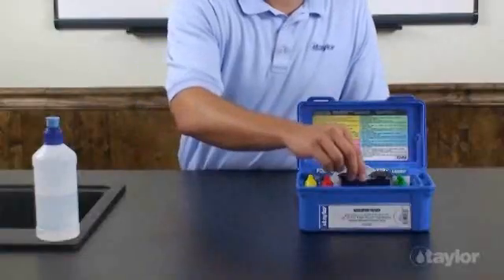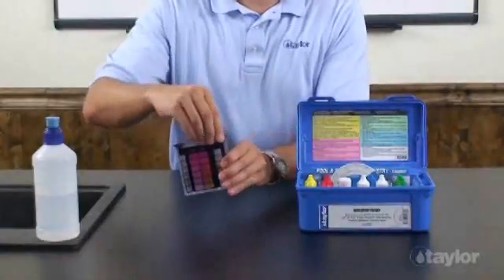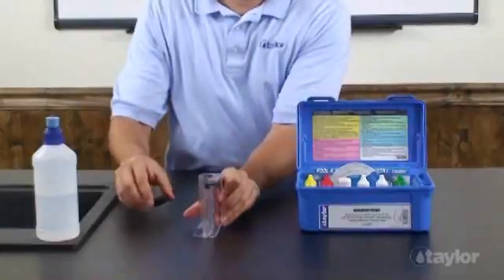To test total alkalinity, rinse and fill the large comparator tube to the 25 ml mark with the water to be tested.